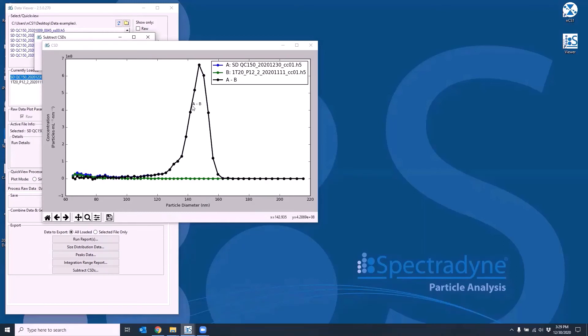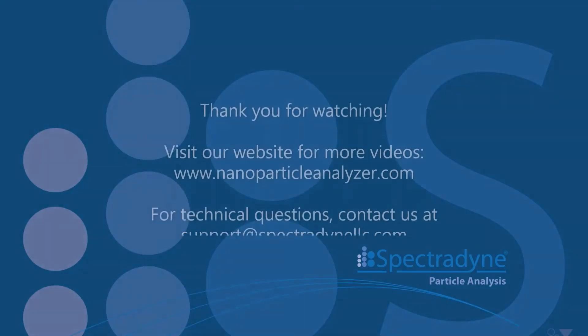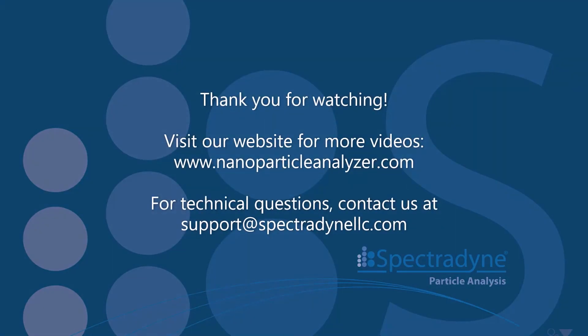You can customize the look of this plot as well as exporting the data to Excel by going to the subtract CSD dialog box. So I've shown you how to combine, save and export the data in the viewer software. I hope you find it useful.